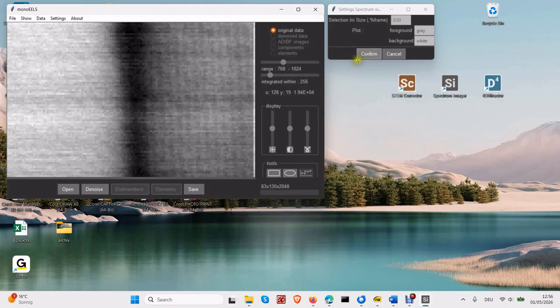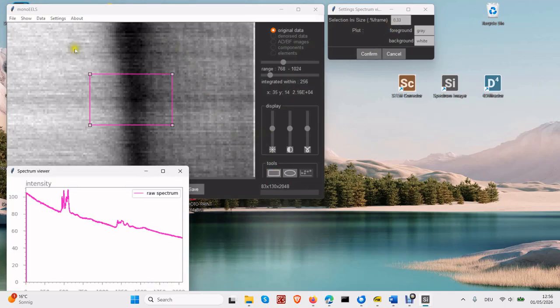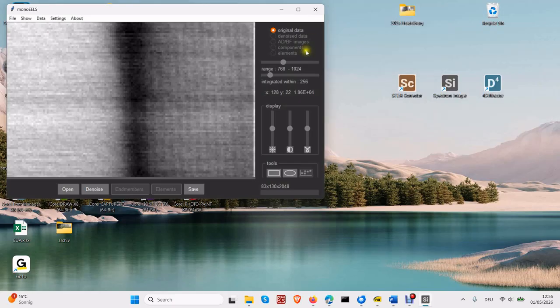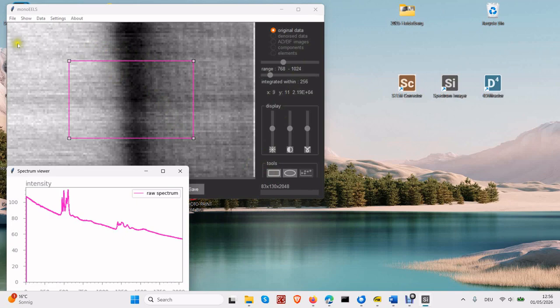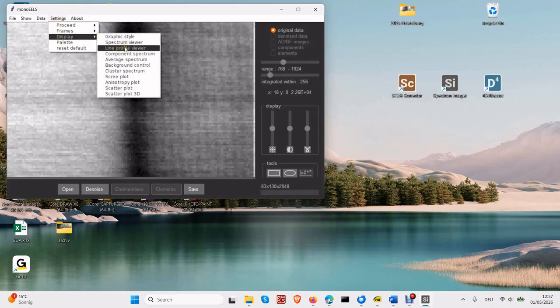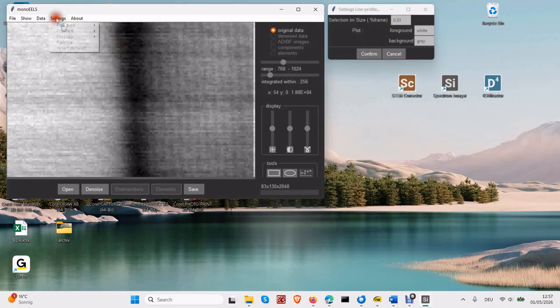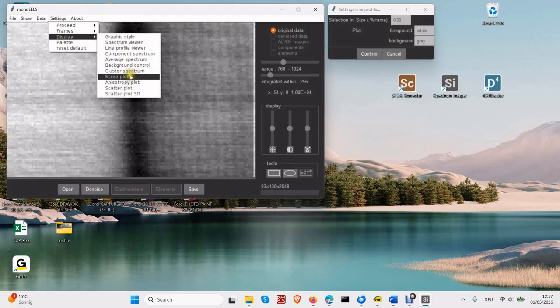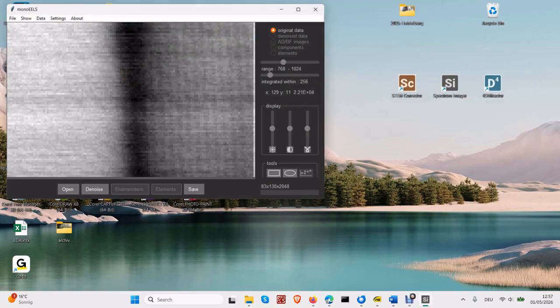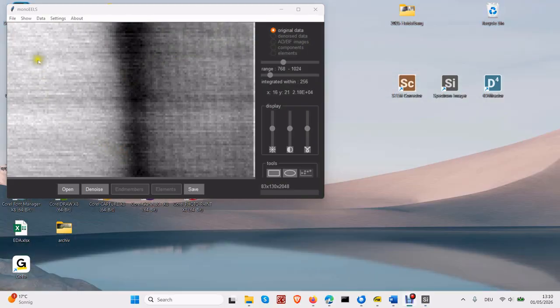It is currently set to about 1/3. This defines the initial selection size as a fraction of the full range. Let's change it to 1/2. Now the initial selection is larger. Similar display settings exist for other views, such as line plot, scree plot, and others. That's all about appearance, but still important.